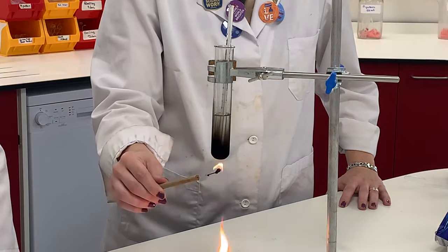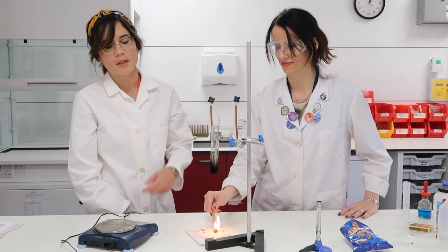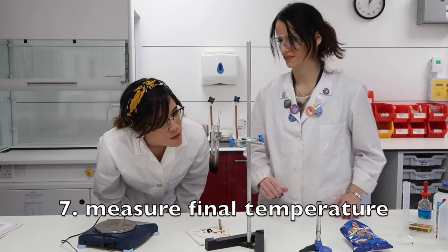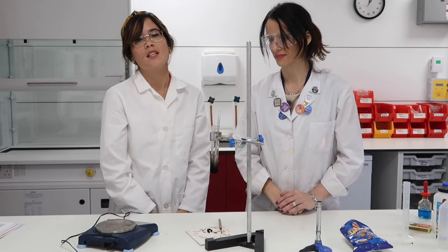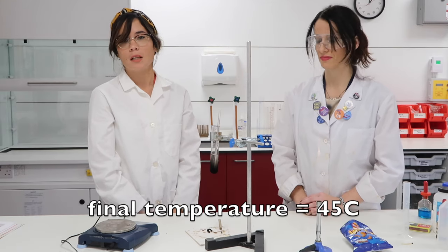It's really crucial that you allow your food sample to burn completely. It's also really important that we have a heatproof mat here to catch any of the cinders. I'm now looking at the thermometer to see the final temperature reached, which I can see is 45 degrees Celsius — so the experiment is complete.